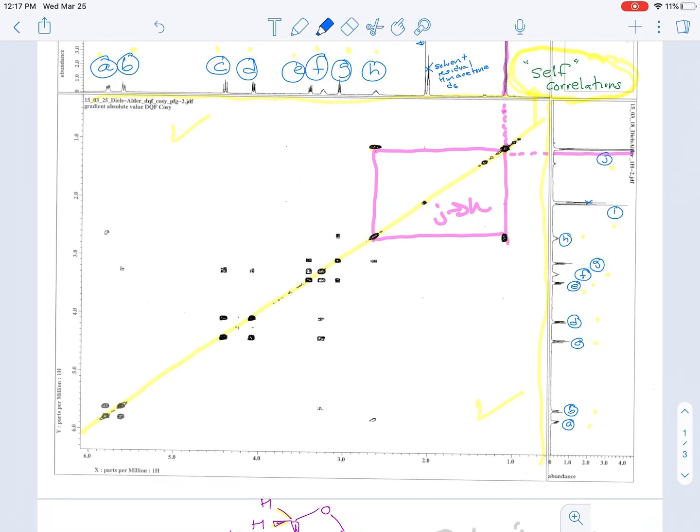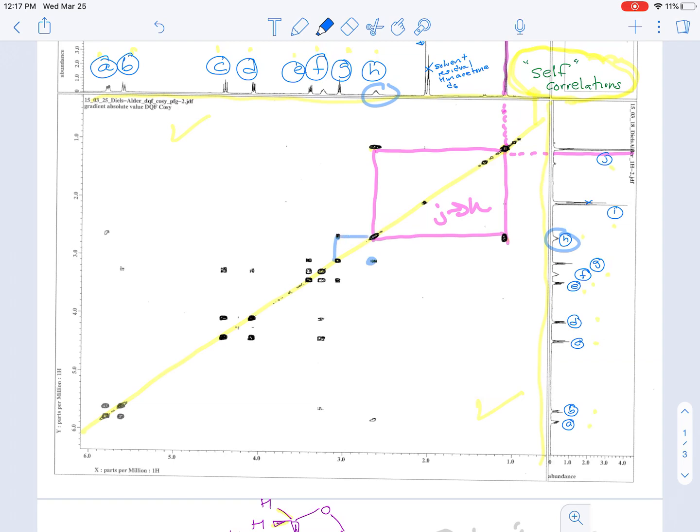So we're going to go now to signal H. And you can see that signal H has a self-correlation, and it also correlates to two signals - one here and then one further down which I'm not going to write yet. So there's the correlation for one of them. And if we look at the chemical shift, we see that this is correlating to G. So H correlates to G.